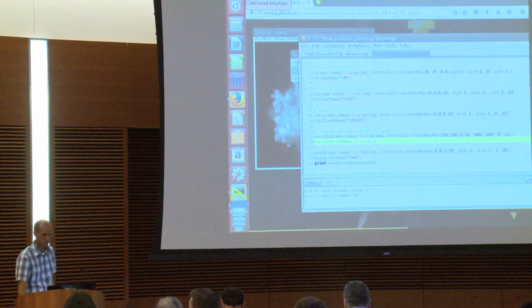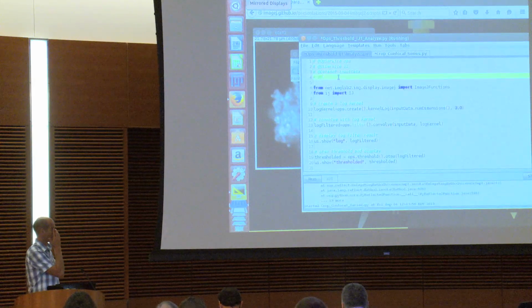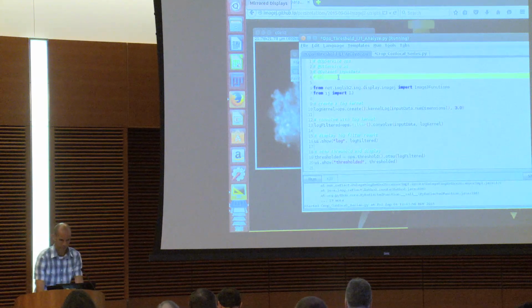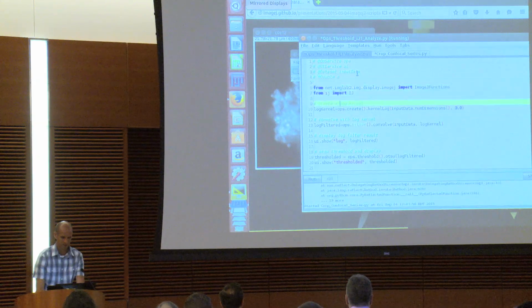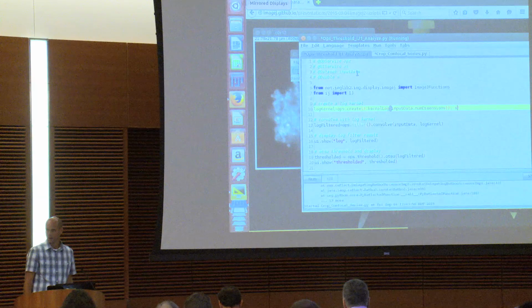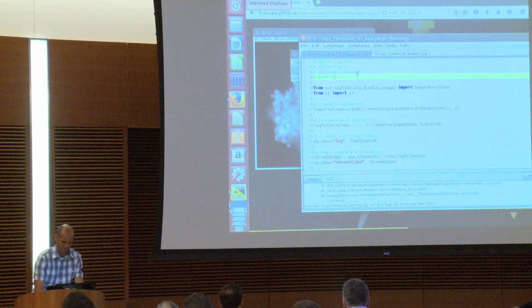Then we go back to the ops threshold, IJ1 analyze. What we're trying to accomplish here is to add a new parameter that's going to define the sigma of the filter. So we can add a double sigma, or let me just call it S for conciseness. And we are going to put an S in here.